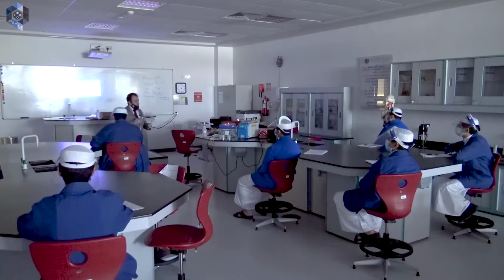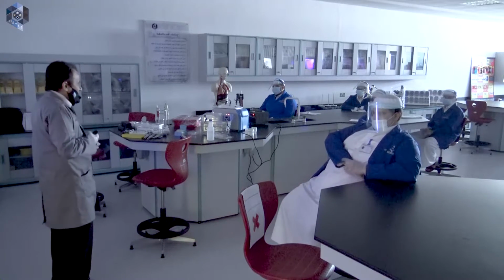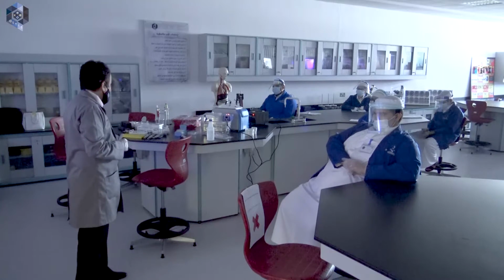Okay? Now, in today's experiment, what will we do? This recombinant DNA, we will transform it into the bacteria. We will force the E. coli bacteria to take it inside. Okay?